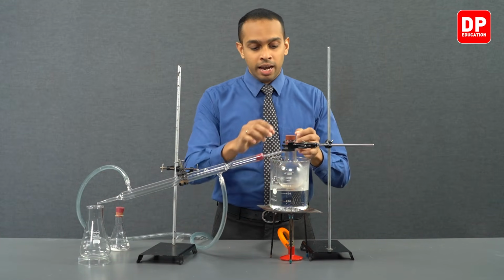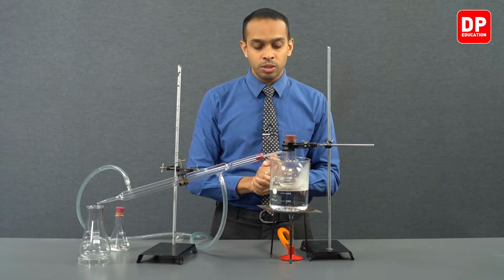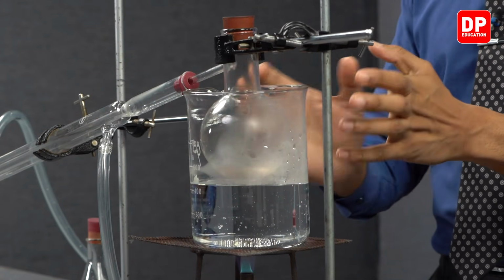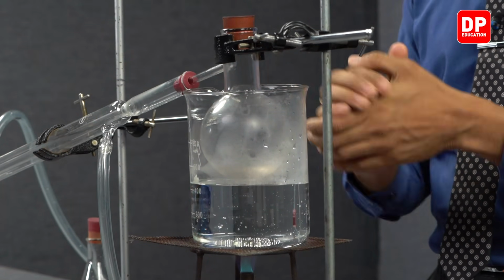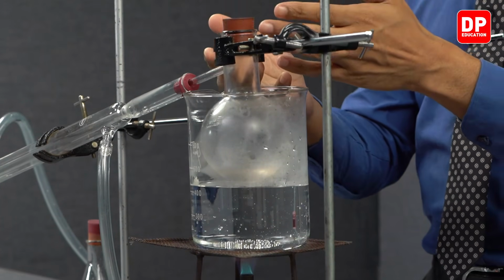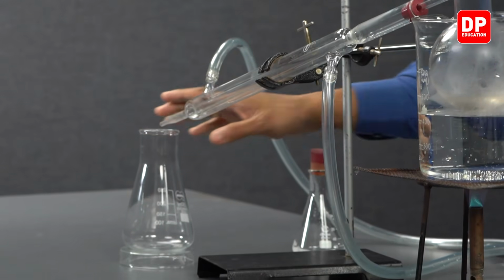You can see as this system heats up, you will see the steam that is produced will heat up this diethyl ether layer that we have here, and all of the diethyl ether will get evaporated and will be separated out into this titration flask we have here.